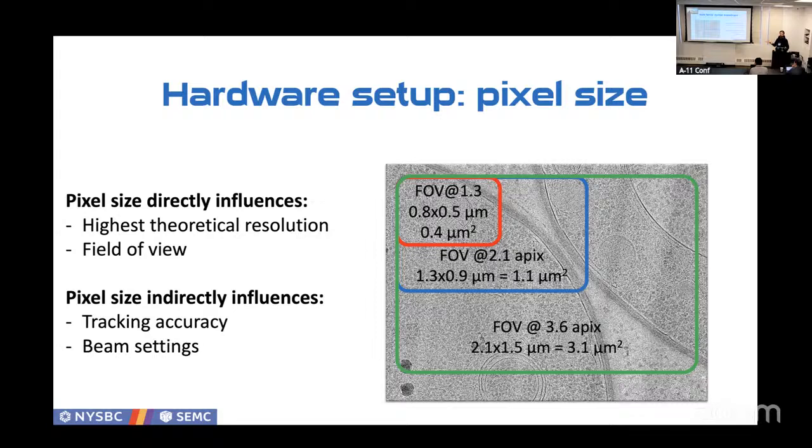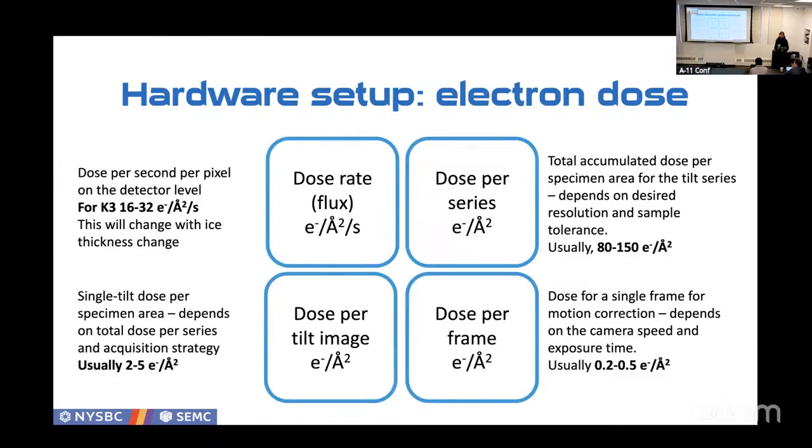So especially if you're earlier in the process, you want to learn your specimen, you want to know how your data looks. Start at a larger pixel size. Start at a large field of view. Collect big fields of view. Collect the data, process it, look at it, and see. Okay, if you hit Nyquist, lucky you. Then drop the pixel size and go collect small.